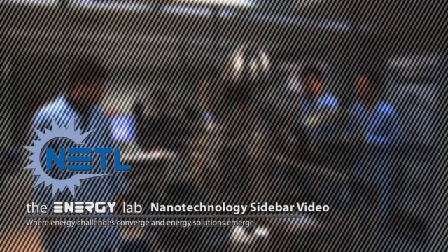Nanotechnology researchers at the Energy Lab use some very sophisticated scientific instruments in their research. Dr. Christopher Matranga will show us two of the instruments and explain their capabilities.